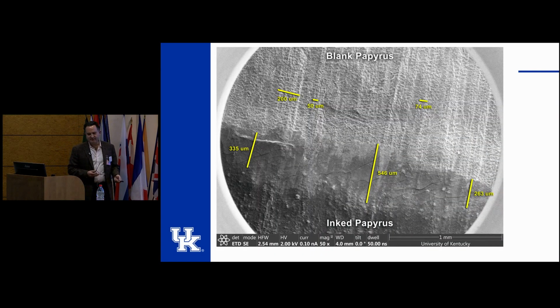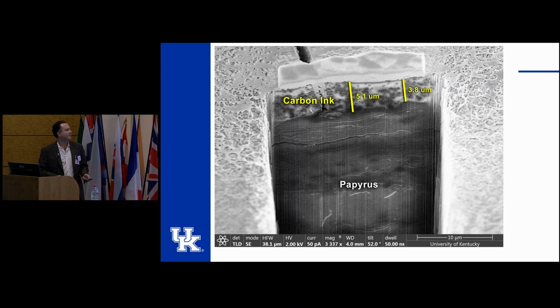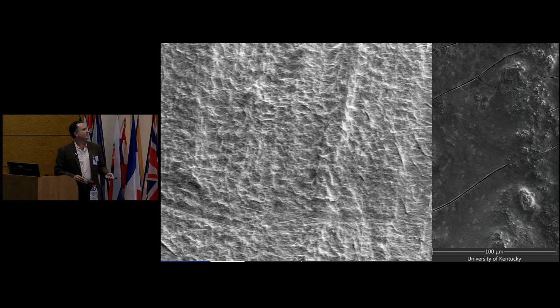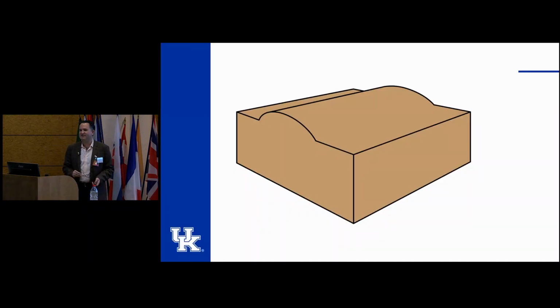So what I'm going to talk about today is the logic behind the deep learning approach that we've been experimenting with. This comes down essentially to the concept of the morphology of what we're dealing with here. In this image, inked papyrus under an electron microscope, what we're trying to isolate is the structure. We can see the papyrus and we can see the ink. There it is again. What I'm about to show you is more close-ups, an oversimplification of the process, but it'll convey what's going on.